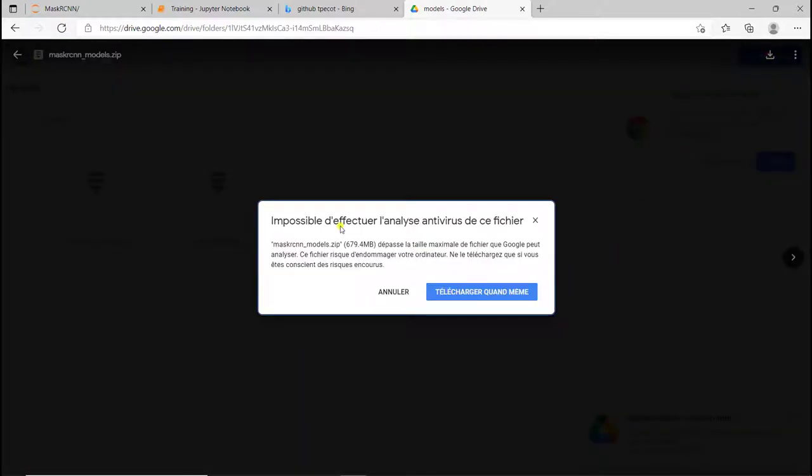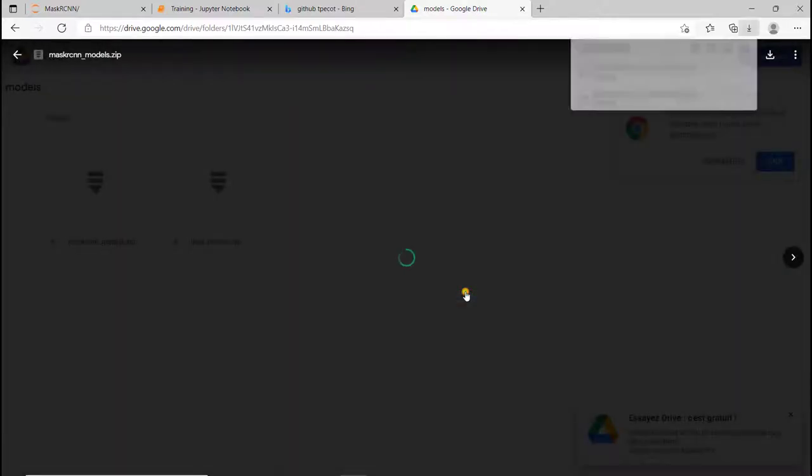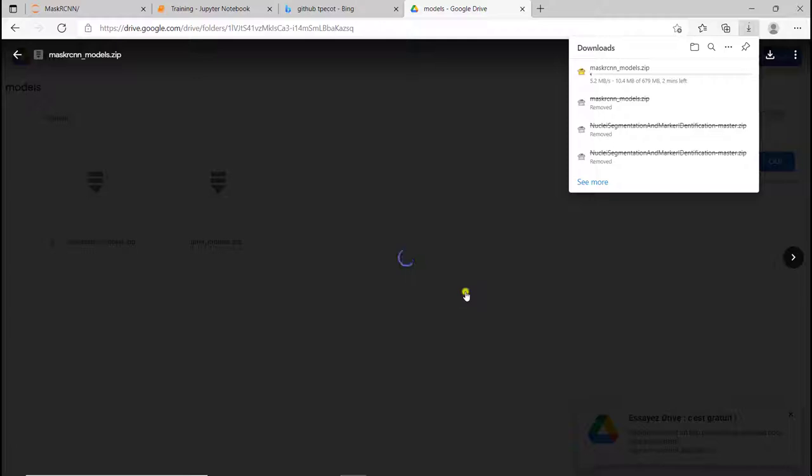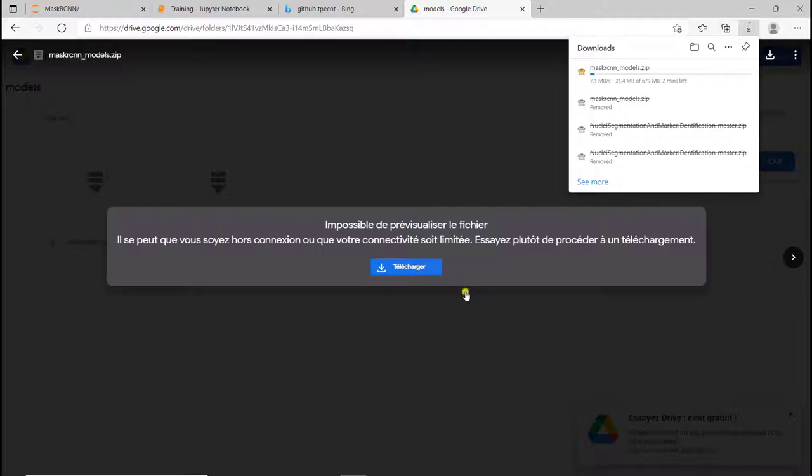It's in French, but it's just telling me that it couldn't verify if it's safe or not. But I know it's safe, so I'm just going to download it anyway. Now I'm going to just speed up the video, so you won't have to wait for the entire downloading time.